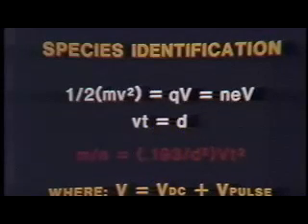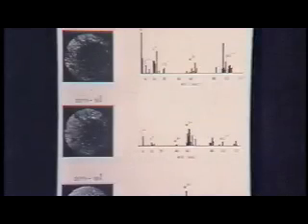Okay, with that kind of technique then, and the power of depth profiling, you can do a lot of neat things. For example, one problem that we looked at rather extensively was what happens in an operating tokamak reactor, an operating fusion reactor, to plasma species that escape from magnetic confinement and strike the wall.